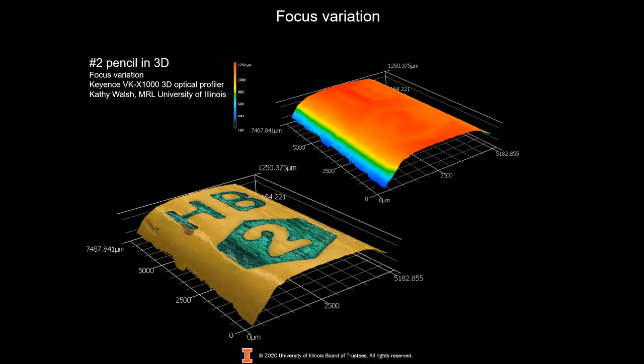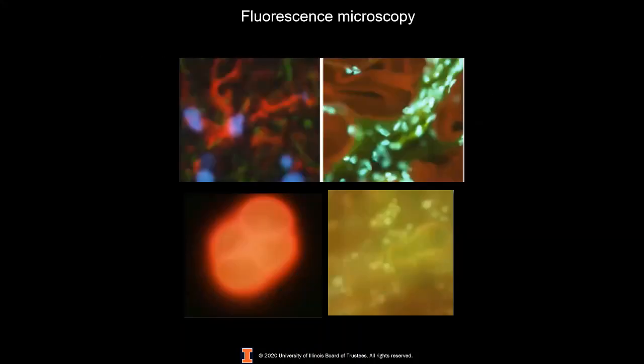As I mentioned before, spectroscopic signals can also be used, and are used often, for contrast in microscopy, like fluorescence or Raman. Fluorescence, for example, like here, is heavily used in biological studies as it helps identify specific biological systems or structures using dyes that bind specifically to some structure or another.